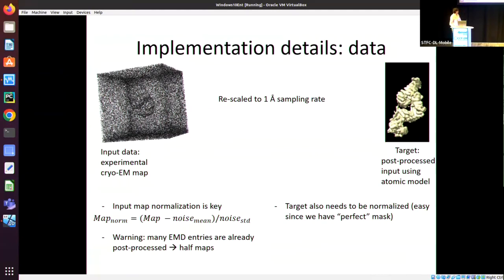And we also needed to normalize the intensity of the voxels, because different reconstructions may have different scales. So we ended up selecting this normalization technique, which basically just scales the noise to have 0 mean and 0.1 standard deviation. Something pretty typical. Although you can do other sorts of normalization, we got better results applying this strategy.